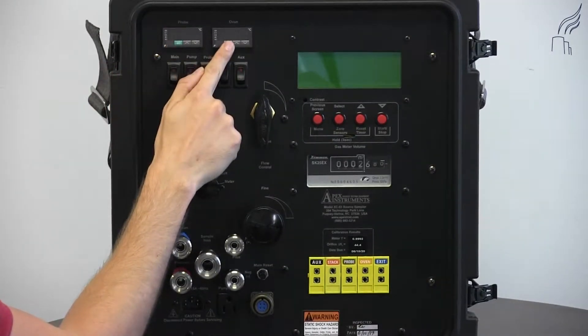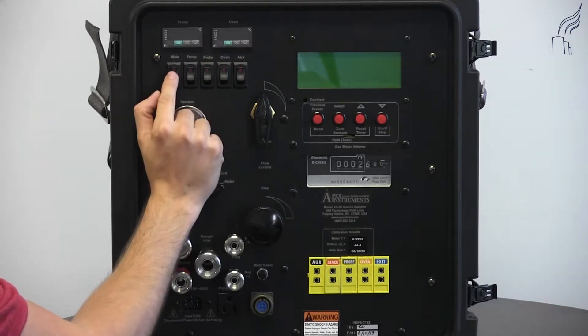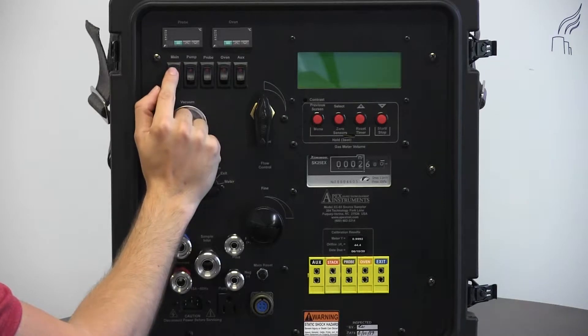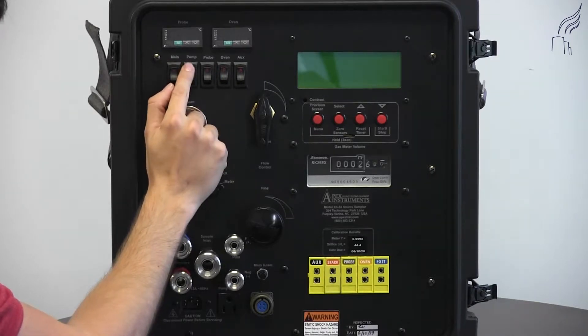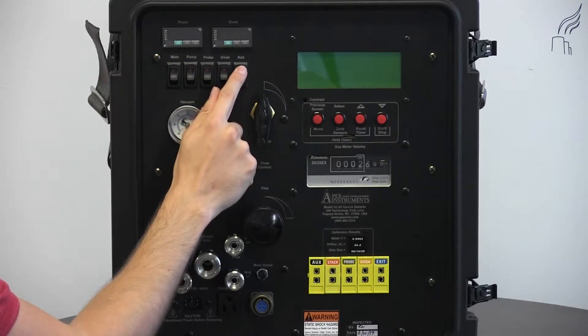we have our probe and our oven temperature controllers. Below these, we have our power switches — our main power switch, pump, probe, oven, and auxiliary power switches as well.